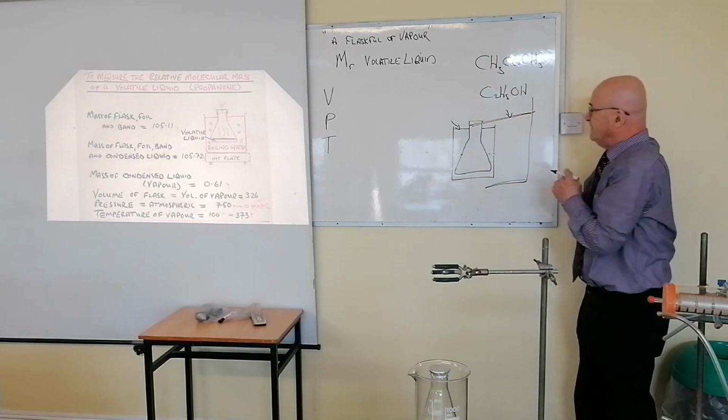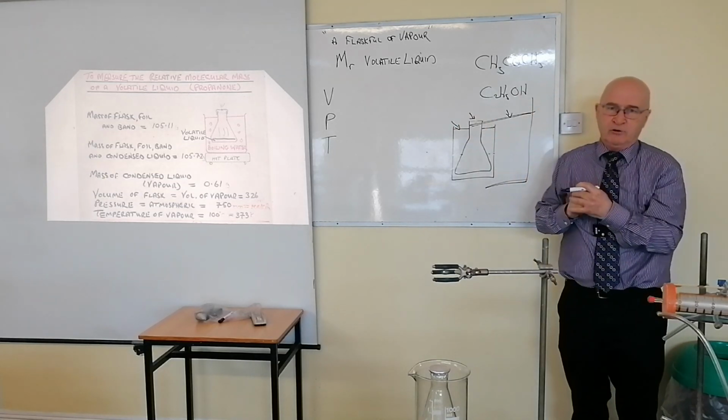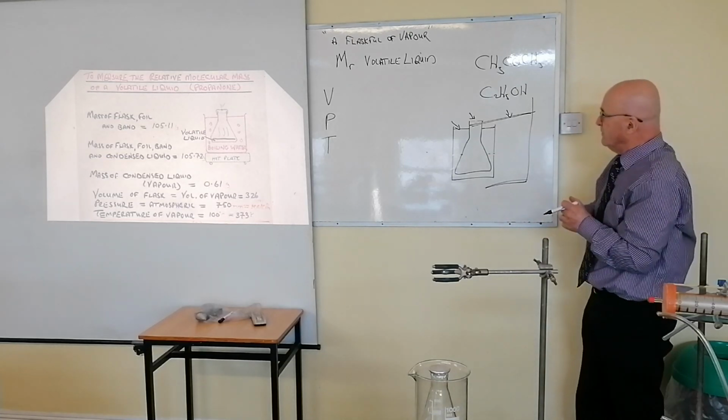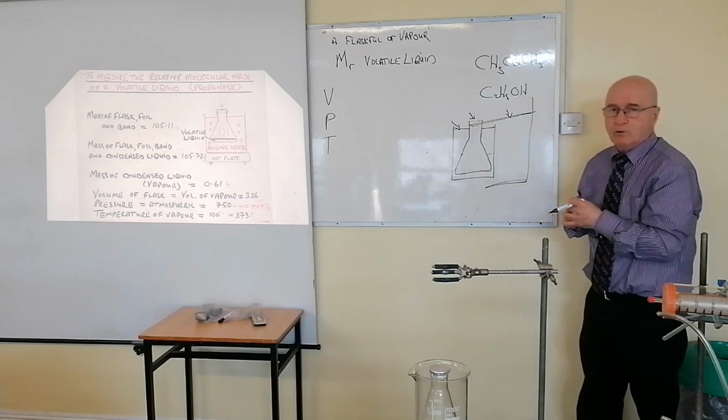I'm pointing at the details you must have, all right? The pinhole is a detail. You must tell them that there's a pinhole there. Your drawing isn't that good, okay? So you need to basically show them the pinhole there. Now, the water level, the clamp, the pinhole with the tin foil, of course, involved, very important.